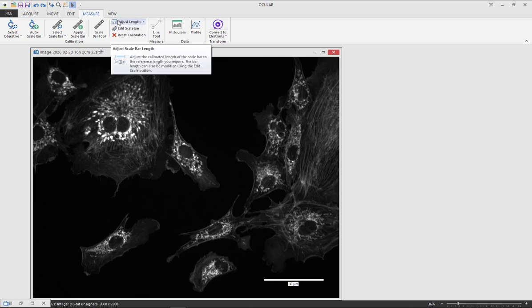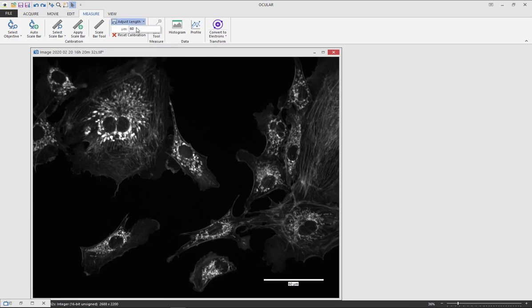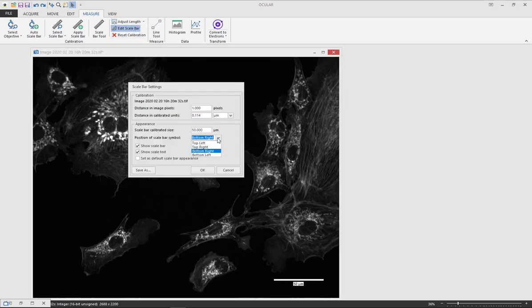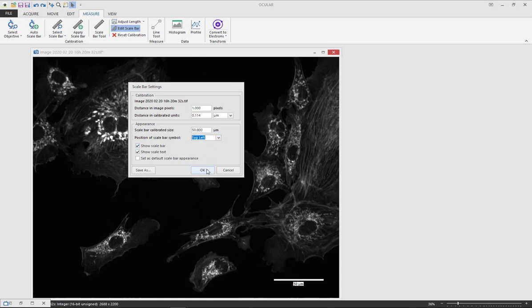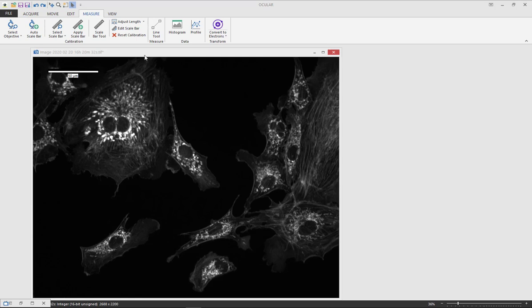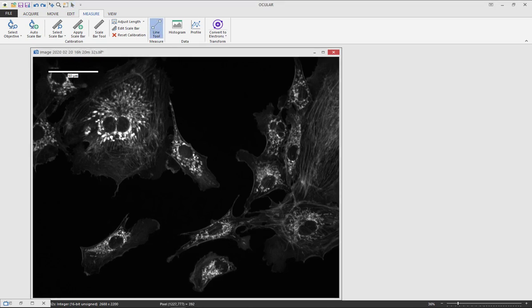You can adjust the length of the scale bar here. And under edit scale bar you can change the position of where it is on your image. Once you've set up your scale bar you can use the line tool to measure your image in microns.